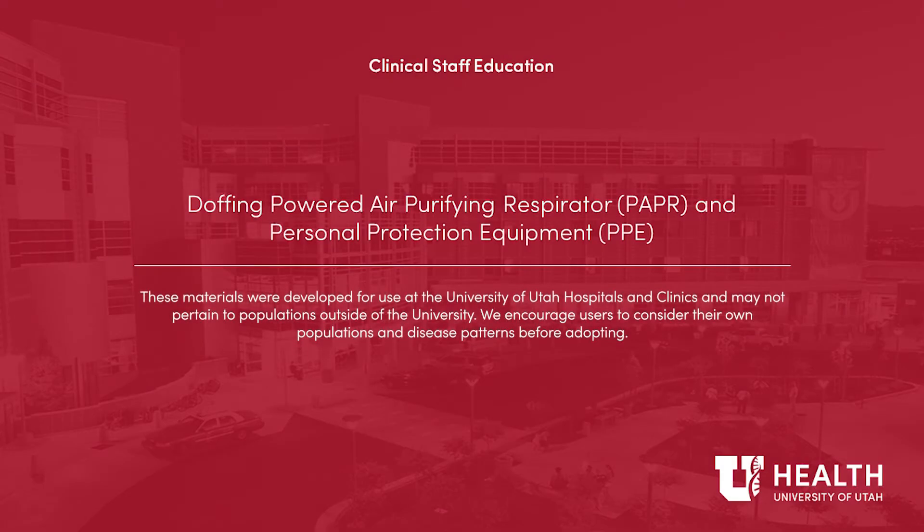Doffing a Powered Air Purifying Respirator, or PAPR, and Personal Protective Equipment, PPE.